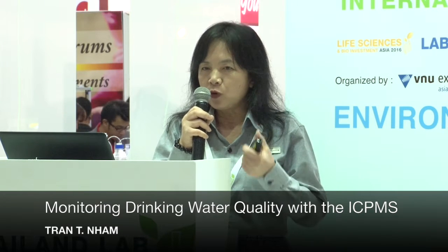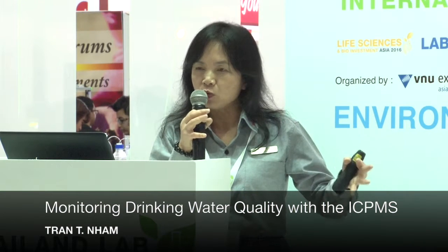Out of this, only the European Union and the US legally set the requirement for drinking water. Other countries just say this is a guideline, you meet it or you don't meet it, doesn't matter. They don't enforce it. But in Europe and the USA, if this is drinking water from a drinking water plant, then you must meet this guideline. So it is important to monitor the elemental impurity in the drinking water.